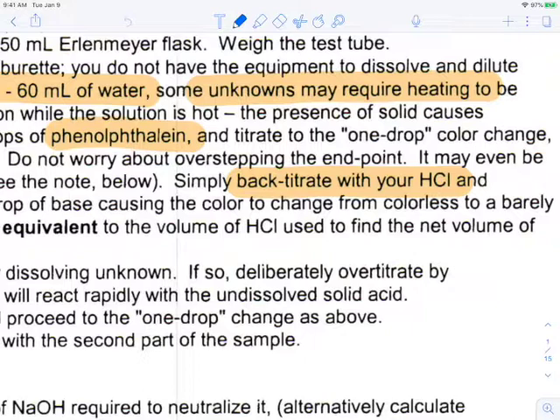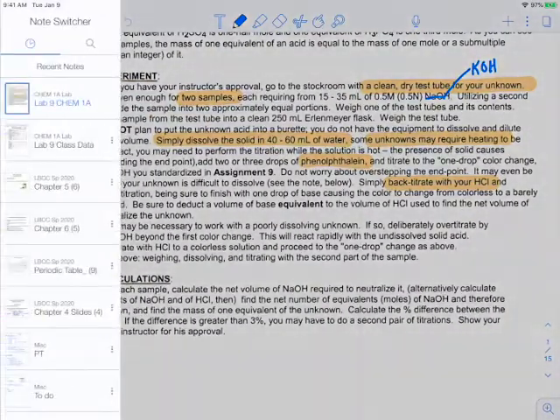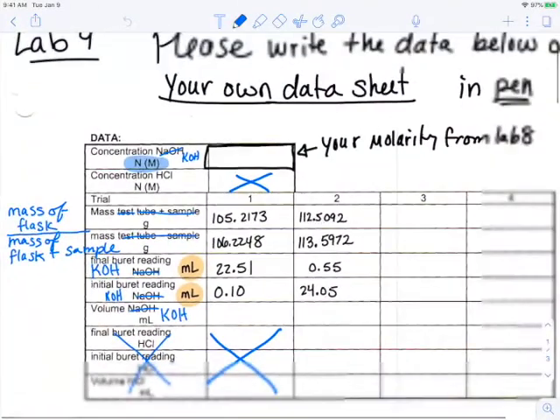With lab 8, you have a strong acid and you have a strong base. Here you have a weak acid with the strong base. So again, you don't tend to see that shocking pink with this one anyways. So it seems to go very well. All right, so that would be your experiment. Let's talk about our class data.